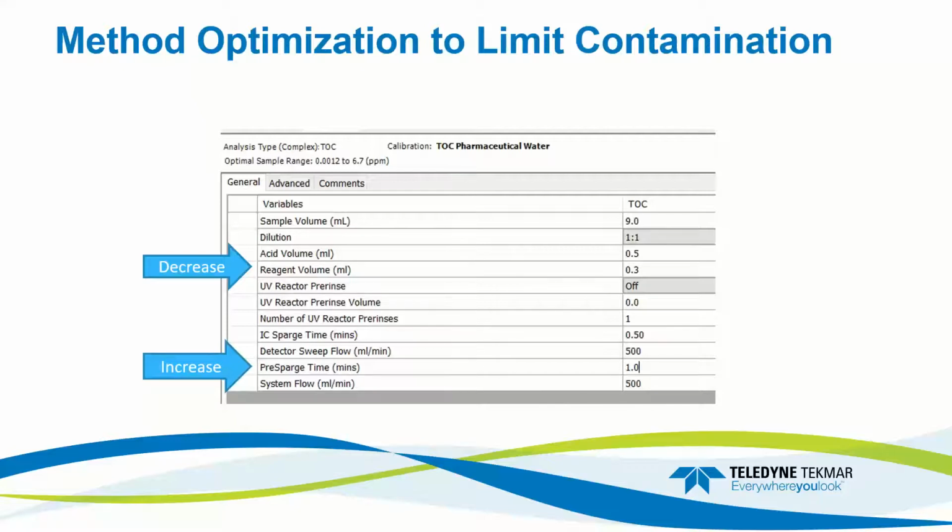I will typically rinse the needle with 9 milliliters of DI water or ultra purified water from our reservoir. That helps us keep things apples to apples. We're pushing the same amount of sample through and we're cleaning up with the same amount of water to ensure that we're correctly coating the pathway to remove any type of interferences.